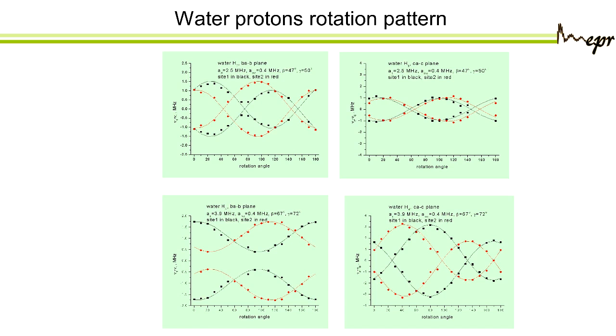So here I show it to you already after it has been separated into different protons, and you get these rotation patterns for proton water 1, proton water 2, 3, and 4, and you get the same thing for the imidazole. For the imidazole, it's good just to test, because then you compare with the crystallography that you get the right position.